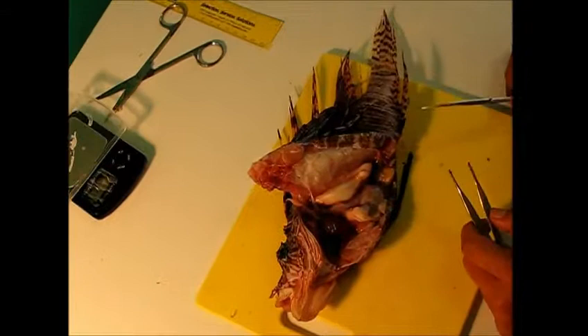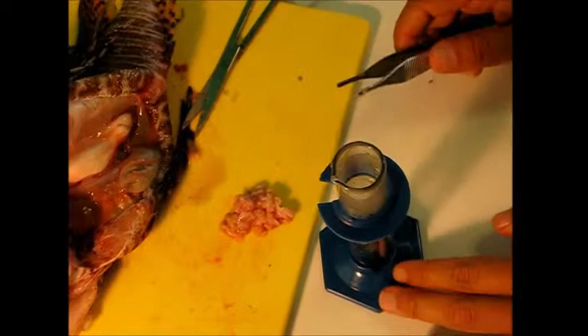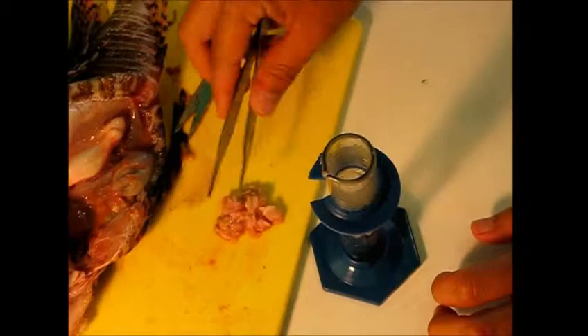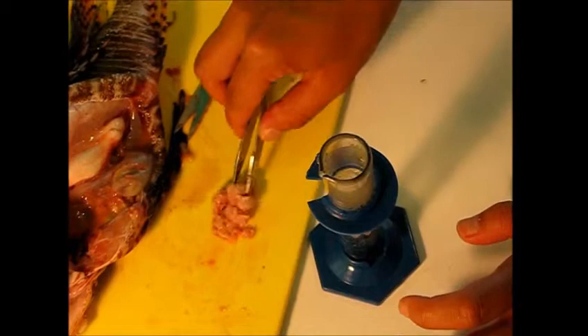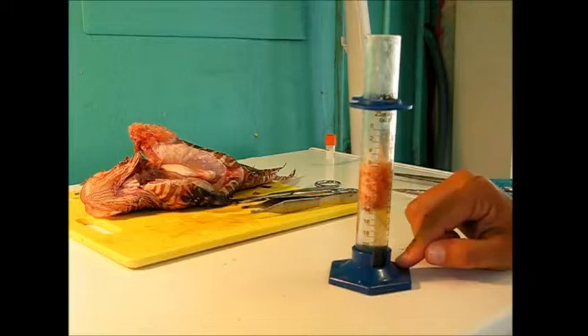The next thing we're going to do is remove all of the body fat and take a measurement of that. All of this white stuff you see is body fat, so we're going to carefully cut it away. We measure the fat using volume displacement — we have 15 milliliters of water in a graduated cylinder, drop the fat in, and see what the change in the water level is. The reading is now at 19.2, so that means there's 4.2 milliliters of fat in this fish.